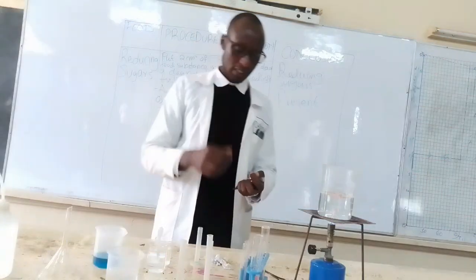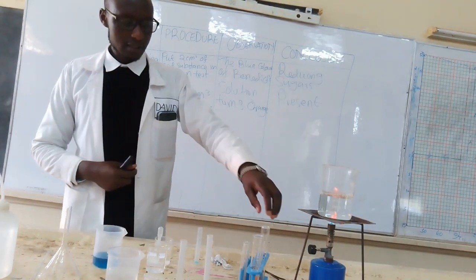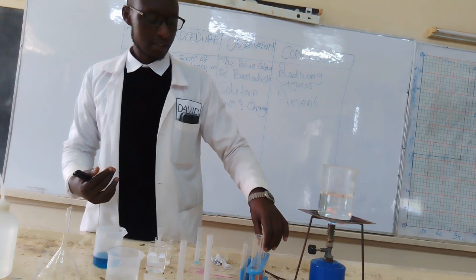In most cases, if there are reducing sugars in the solution that we are given, this is the color. But sometimes the result can be negative.